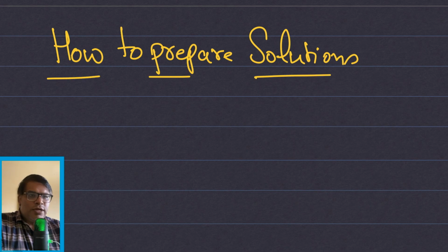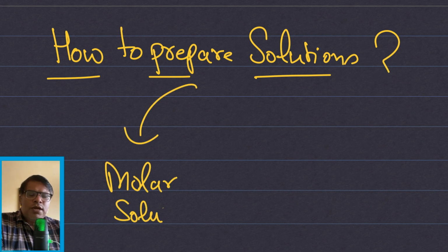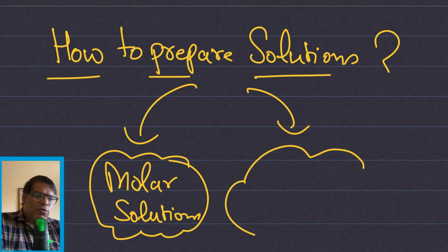In the laboratory, most of the time you are going to prepare two kinds of solution. One is molar solution, and another is percent solution.